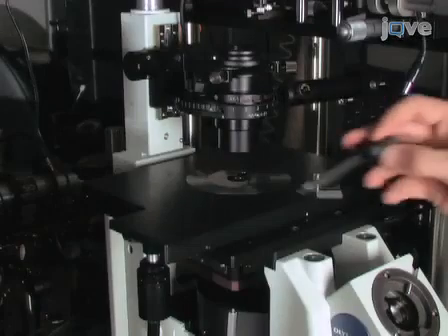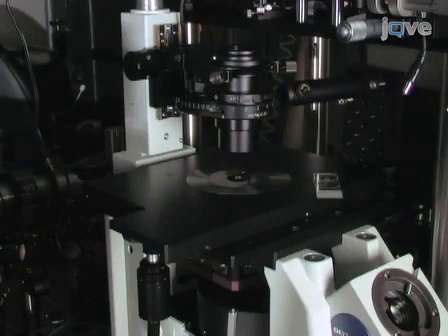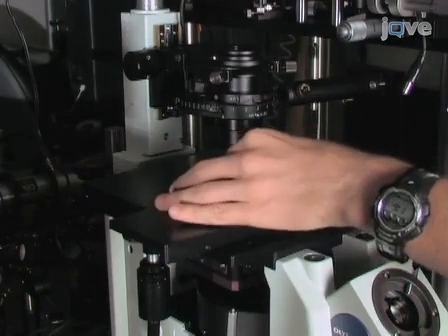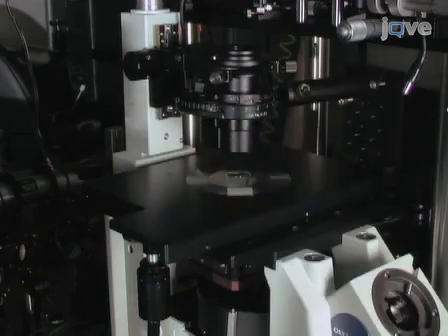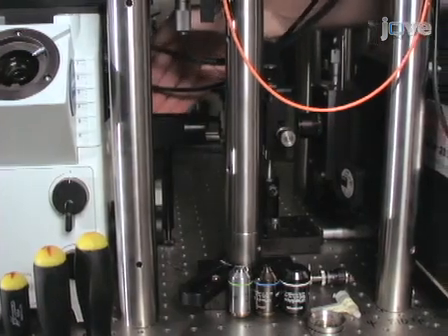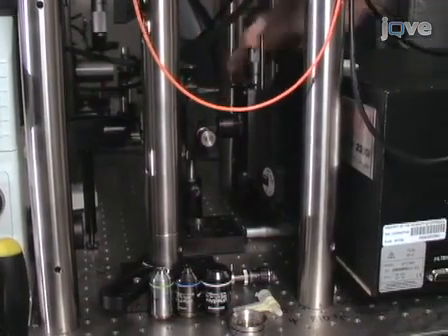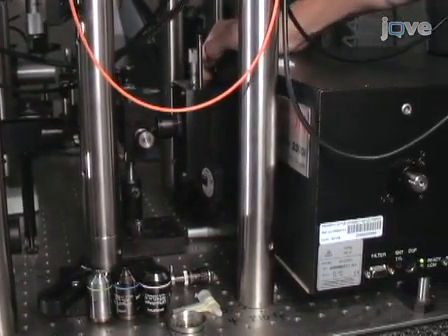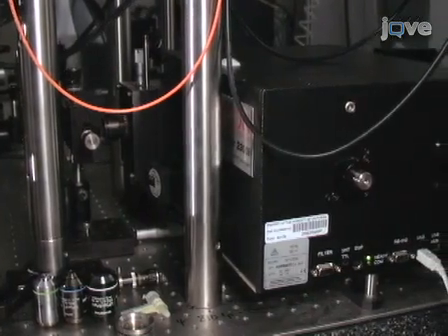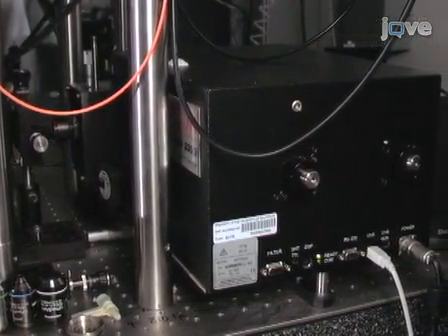The interaction of 3 short-pulsed laser beams at the sample results in the generation of several 4-wave mixing signals, such as CARS from the various combinations of 2 lasers, as well as 3-color CARS and DR CARS signals from the combination of all 3 lasers. When signals are relatively close in wavelength, it can be difficult to separate them for analysis. For this reason, signals are passed into an imaging spectrometer that also serves as a monochromator or bandpass filter to spatially separate signals at different wavelengths.